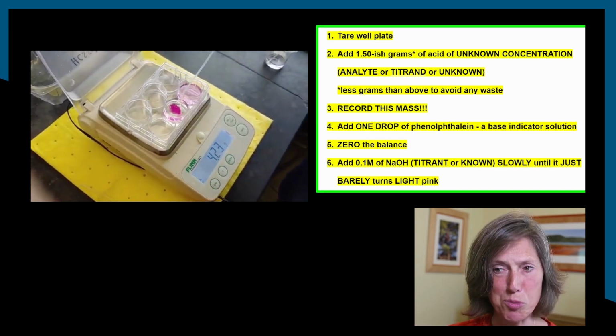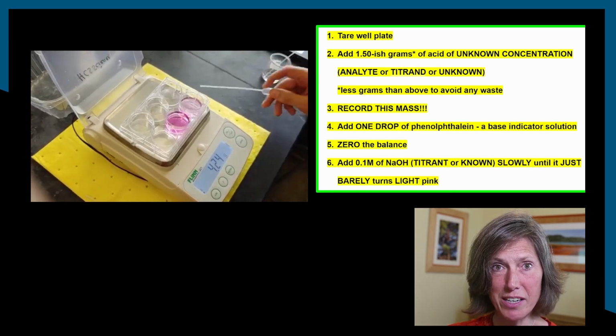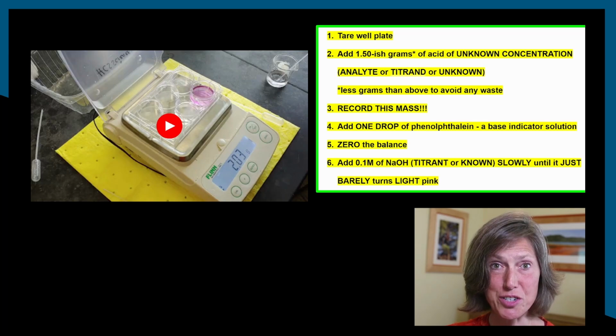There it is. That's probably the last drop needed. A little swirling, it stays pink. We've reached the end point of the titration.